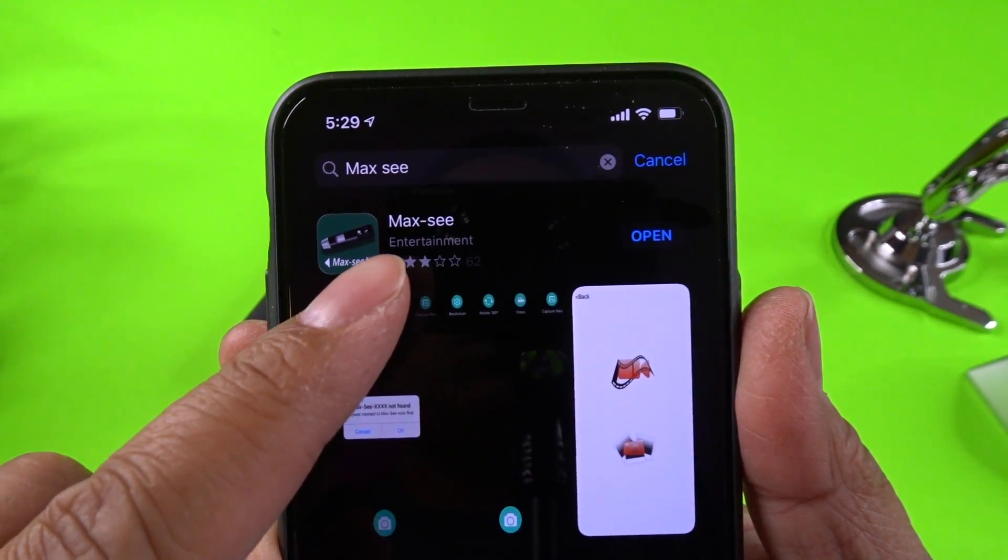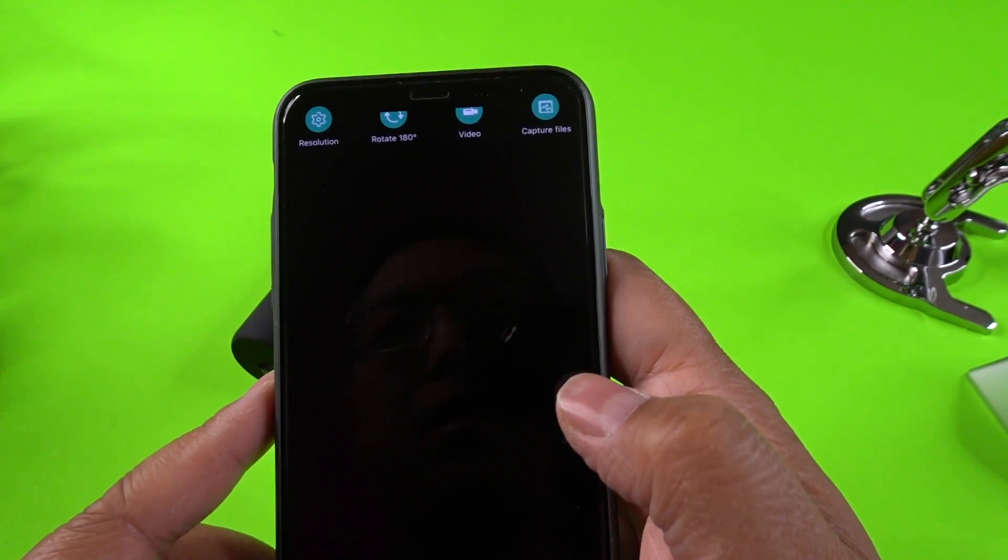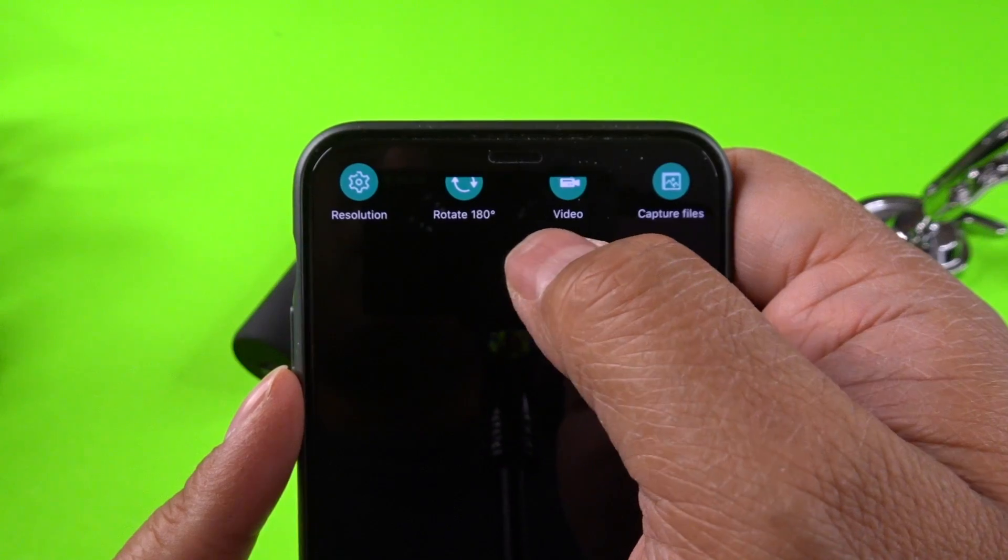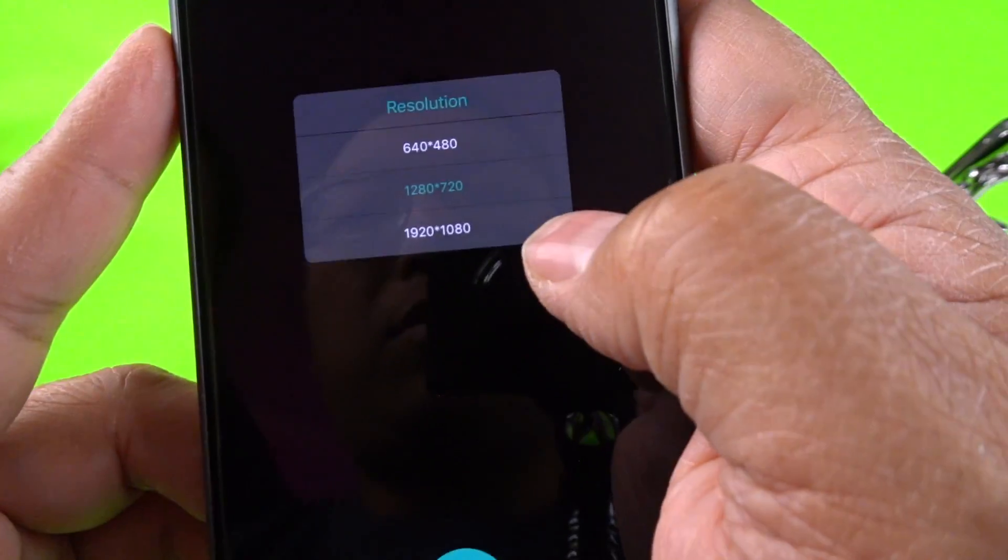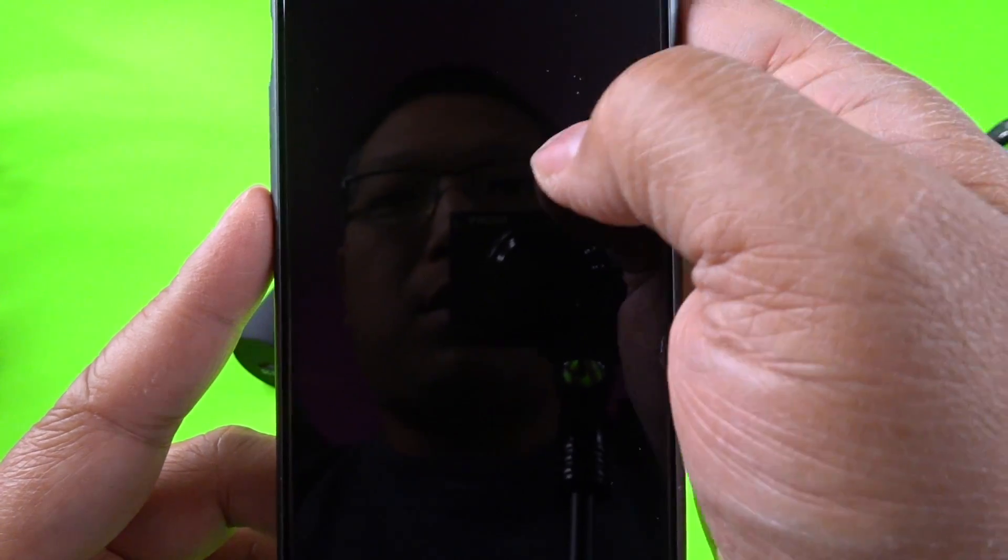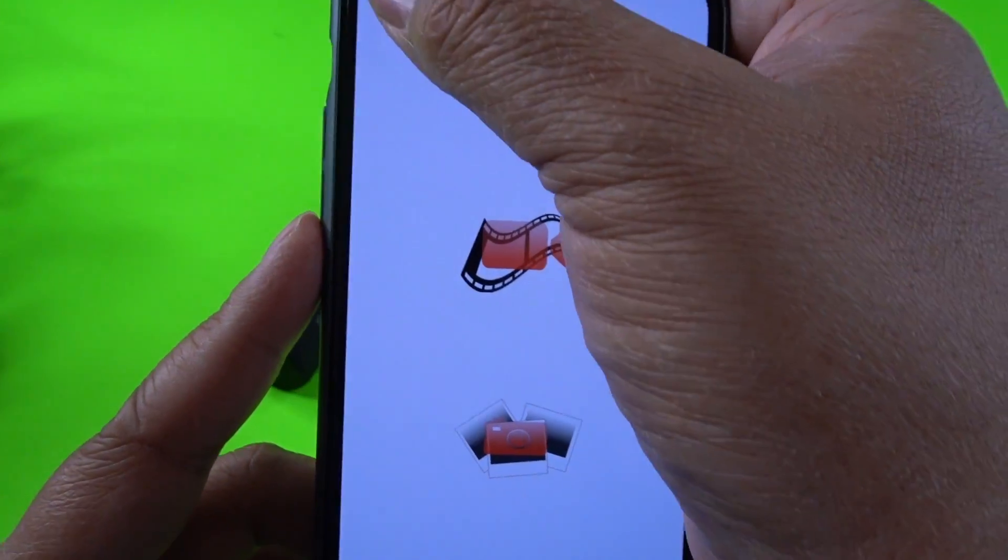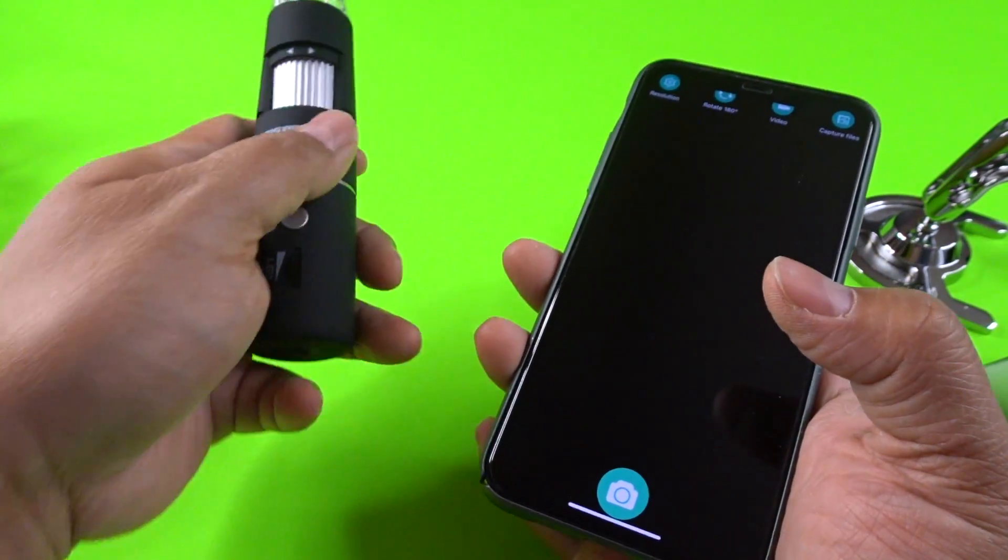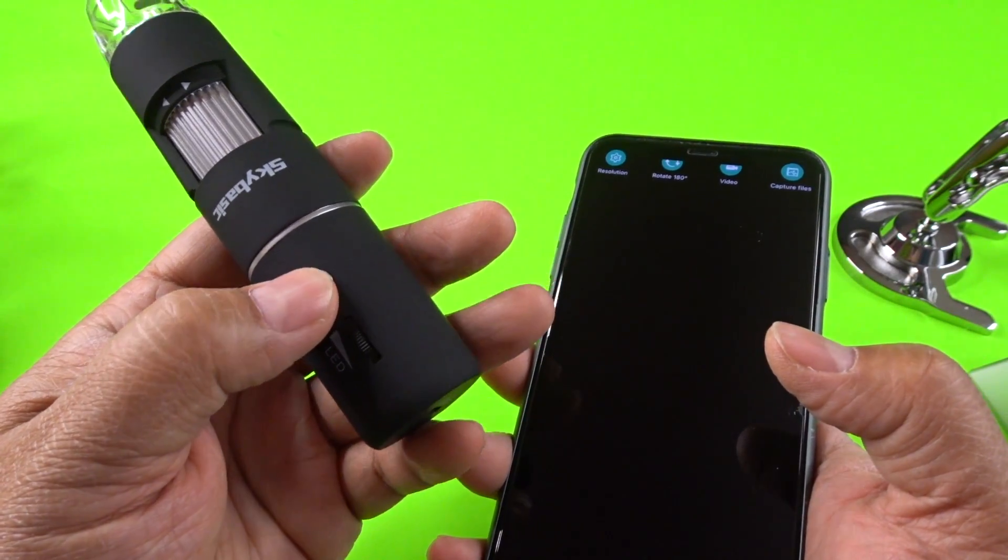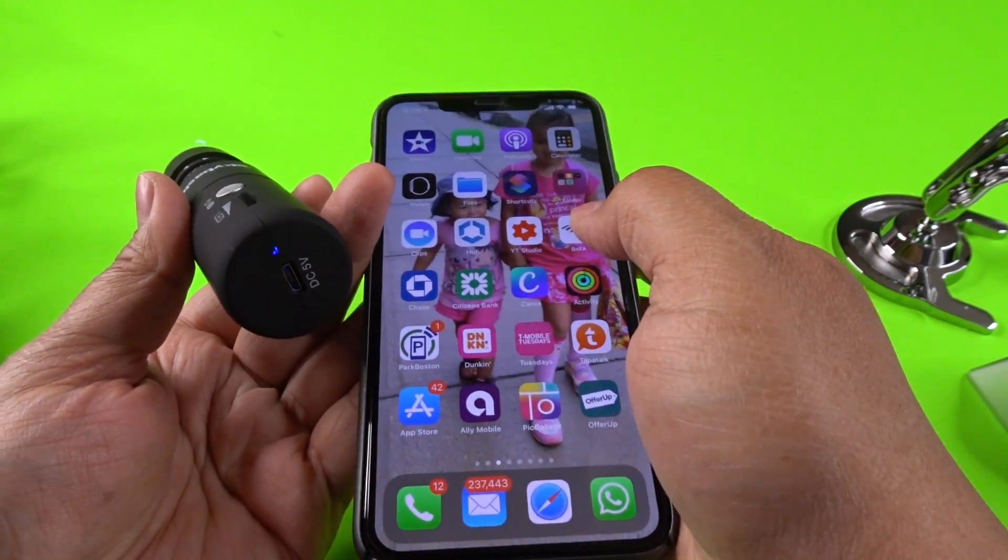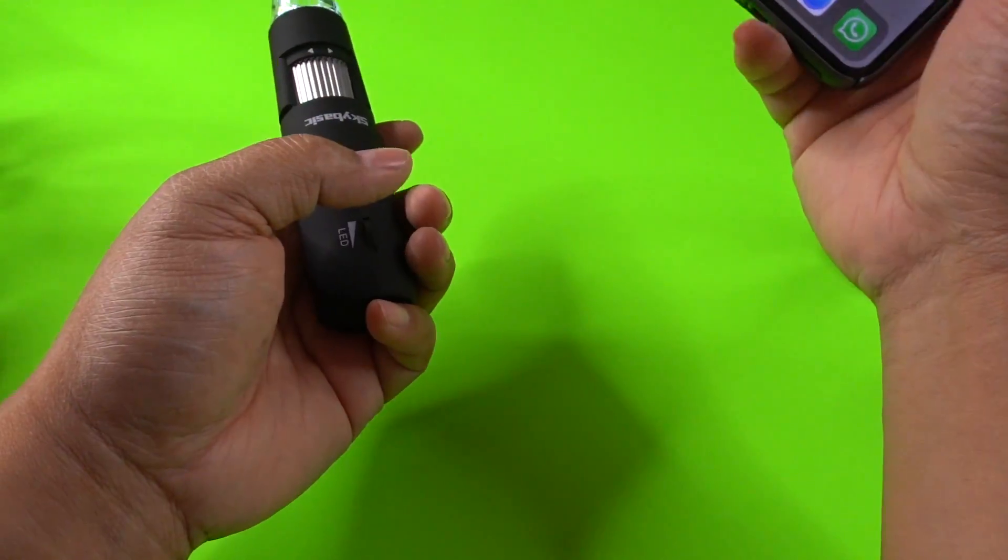Alright I've downloaded the app called Max C. I'm going to open it up and it looks plain. There's your options. Resolution. Rotate. Video. Capture files. If you go to resolution it's set to 720. Let's go to 1080. Okay so let's turn this on and connect. So I'm going to long press the power button. And the lights come on. So now I'm going to go to my wi-fi settings. So I'll be right back. Let me just connect it.